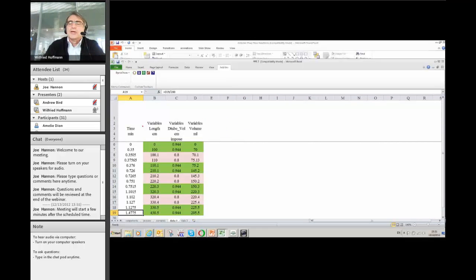but what has changed is the data sheet. And now you see what is the reason behind using these mapping of the lengths and the volume in the data sheet as experimental data, if you like. This now gives us a picture of our plug flow reactor. You can see directly here, the green, I highlighted this. These are the single tubes and the space in between. These are called the connector tubes. And you see here the imposed, the diameter from the connectors are different.